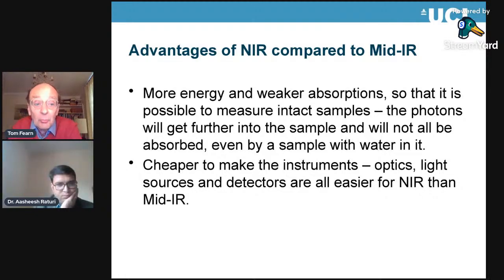We're still talking millimeters, maybe a centimeter, but not enormous depths. But it will go into intact samples, and it won't all be absorbed because the absorptions are weaker, even if the sample has got water in it. And water is one important reason for the interest in NIR.